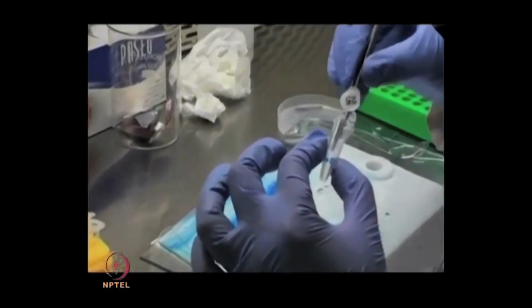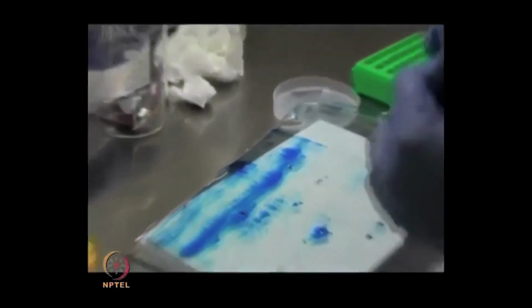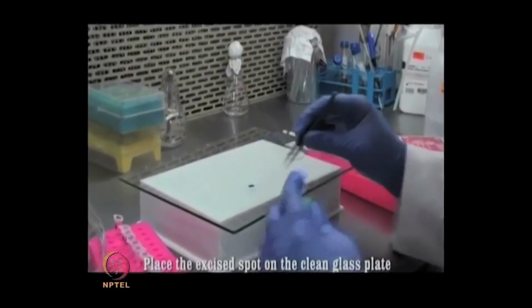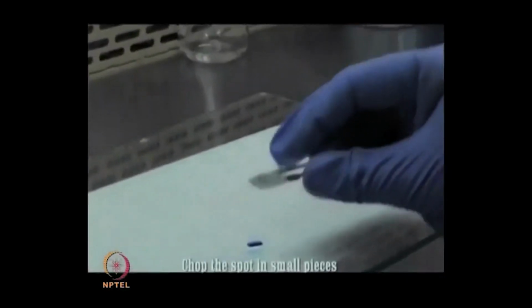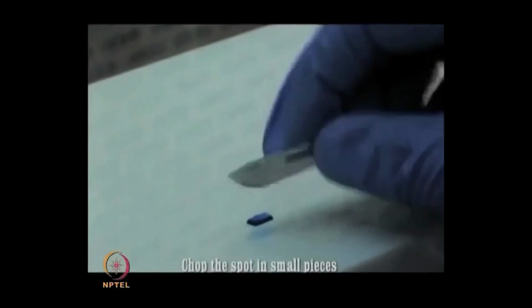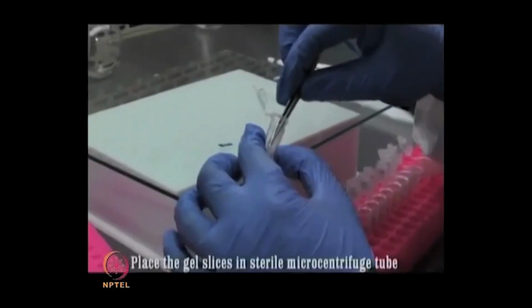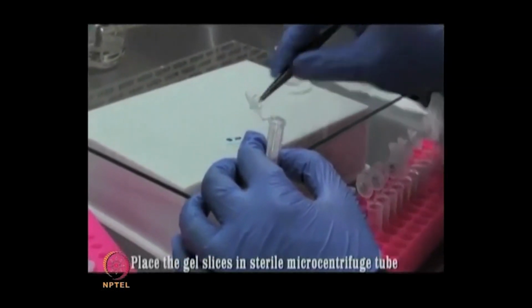It is possible you have excised a large spot or large band, then cut the slice into cubes while avoiding too small pieces as they can clog the pipette tips. So, this is the larger spot. You cannot directly take this one for doing the in-gel digestion. So, you need to excise that into small cubes. Now, keep these small gel pieces into a sterile microcentrifuge tube.